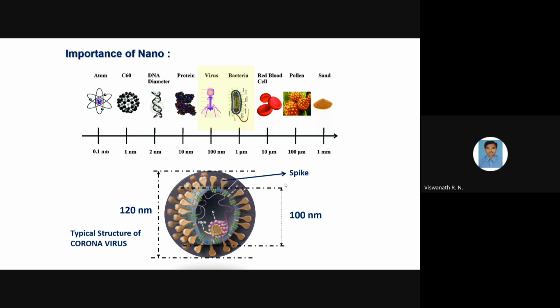But since the viruses are smaller and their surface energies are changing with the host medium, where it is going to sit, it is very difficult to configure the full structure of the viruses. It means the energy at the surface of the viruses is high compared to the bacteria.